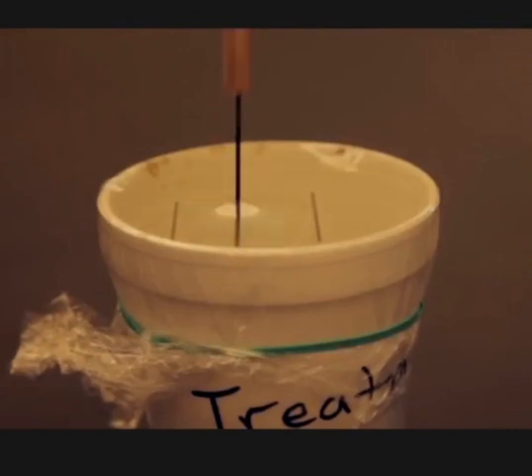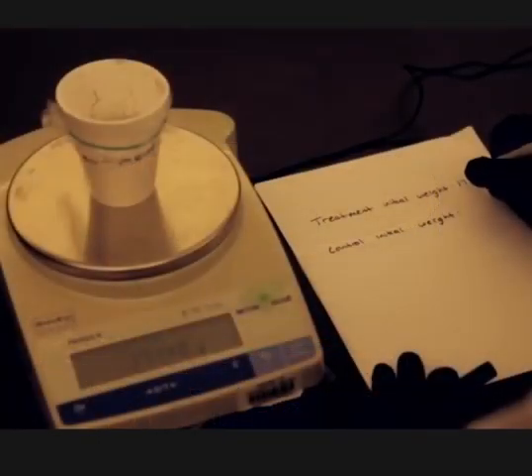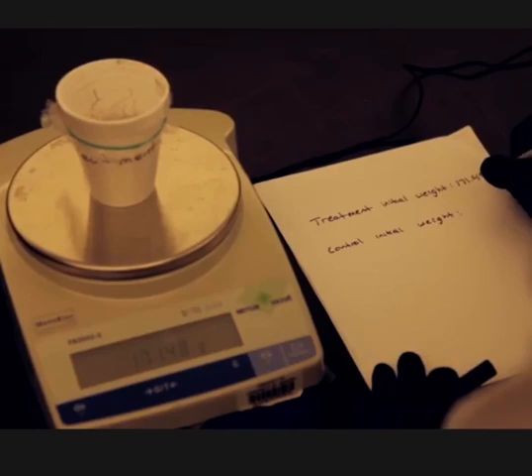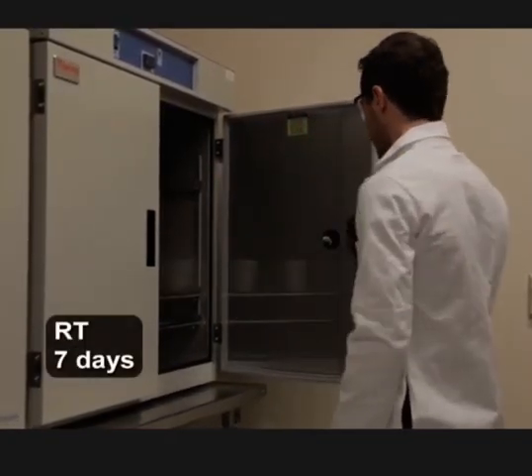Puncture the plastic wrap several times to allow air transfer, but still prevent excessive evaporation. Finally, weigh both cups, record their weight, and incubate them in a designated area at room temperature for 7 days.